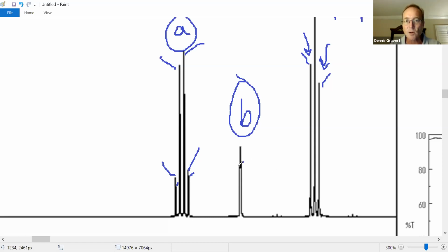No, it's not. Okay, so don't overanalyze like that. You need a gap between one peak and the next, right? As you look at this peak right here, this peak goes all the way down to the baseline before the next peak begins. So this little shoulder right there, just ignore it. That is not a peak.